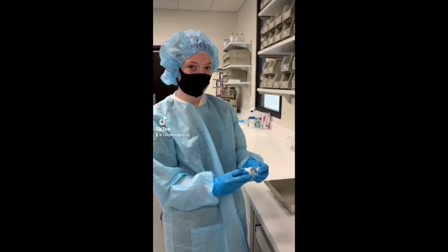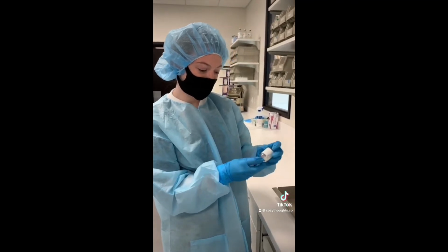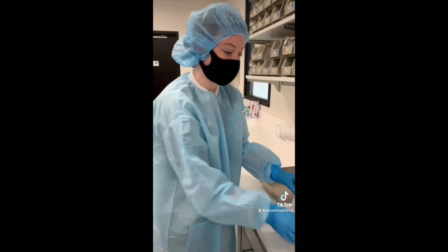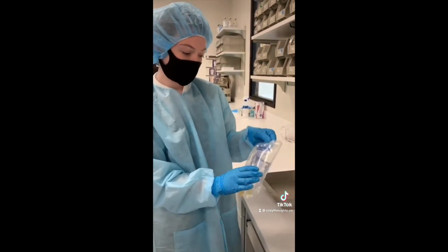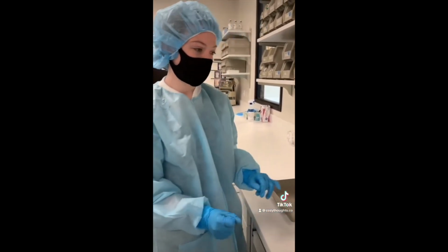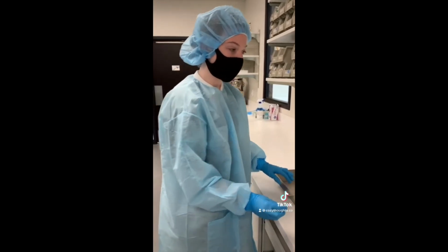So today we'll be making an antibiotic called cefepime, but we actually have sugar in here today, and we'll be using water to reconstitute it, and then we are going to put it into this dextrose bag, which is actually sugar and water. So we first have to wipe everything down with alcohol to sterilize everything. So we will start that.